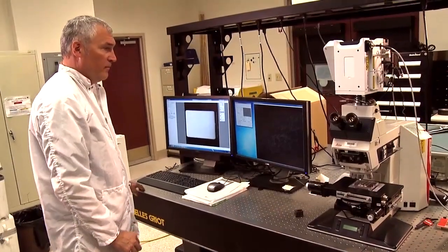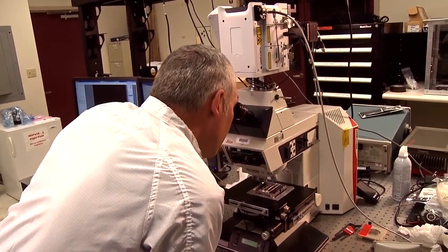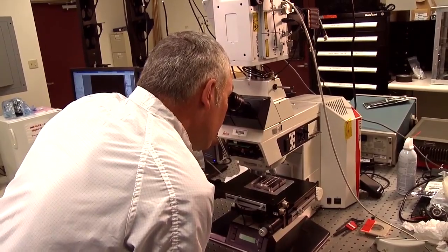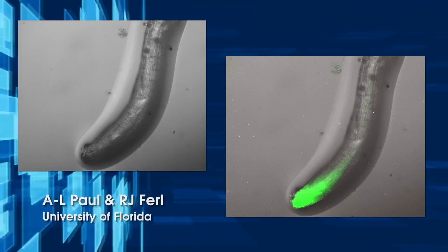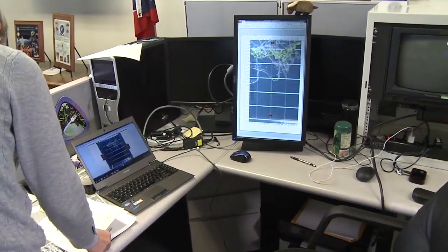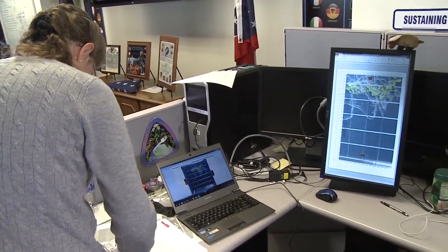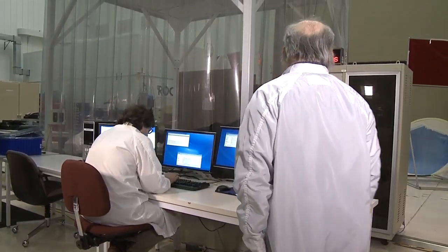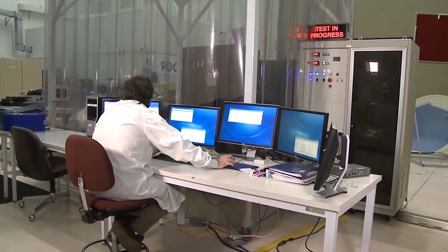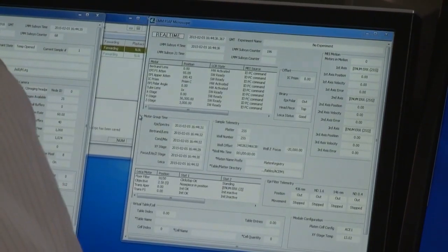Glenn Research Center comes into the deal because they have the very specific type of hardware that we'd like to utilize on orbit, the LMM. The Light Microscopy Module allows us to take a closer and deeper look at some of the gene expression patterns that can be revealed by the fluorescent reporter genes that we've engineered into our experiment. GRC handles not only the experiment itself from the imaging point of view, but has also been very good about allowing us access to the people and to the ground unit for the LMM, both before, to tweak the systems, and also to test some of the new parameters that we would like to explore.